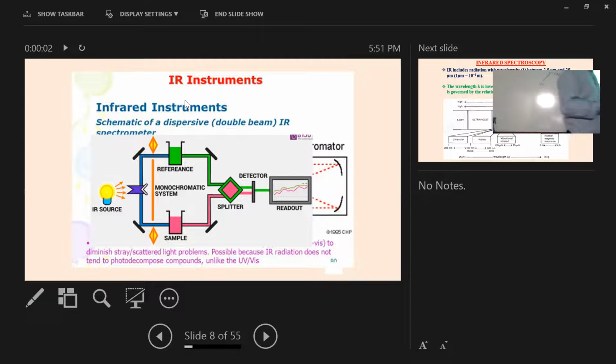Or if it contains water, or methanol, let us consider, here also methanol. These are our two solvents, therefore the same solvent. So if we do not have any other molecules except the methanol, in that case, if we have 20% absorbance, here we will also have 20% absorbance.